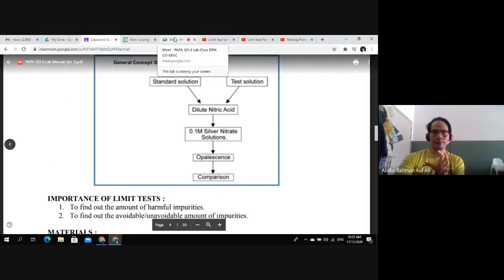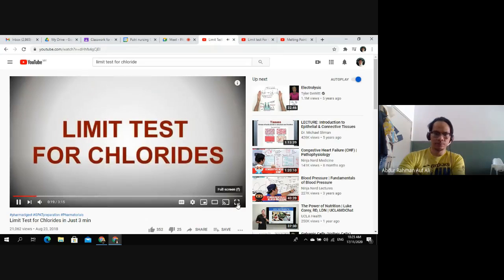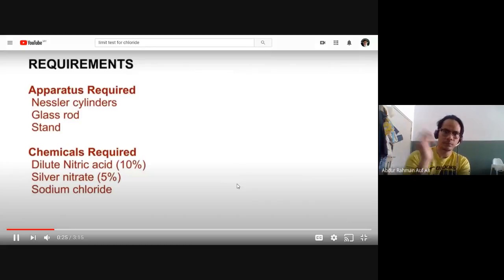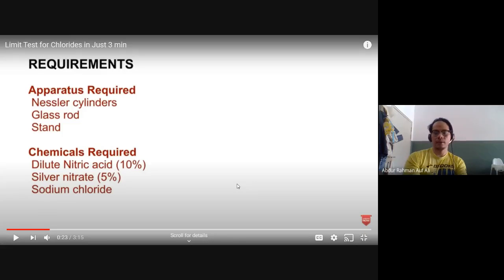In order for you to actually see what I just said just now, saya nak tunjuk satu video. Yes, so this is the video. So these are the apparatus needed. Minimal apparatus, Nessler cylinder dan tabung uji, glass rod untuk mengacau, and satu rack for you to put the tabung uji.